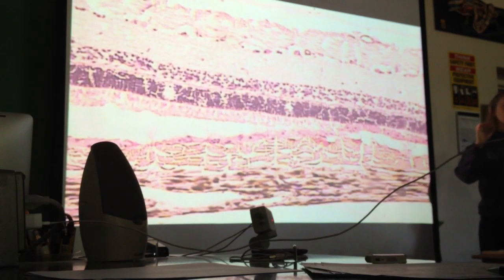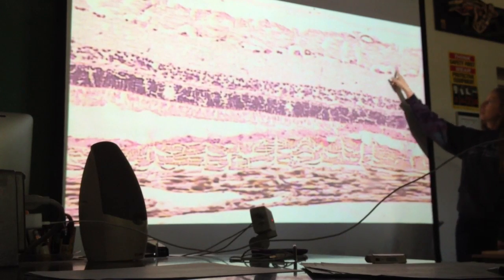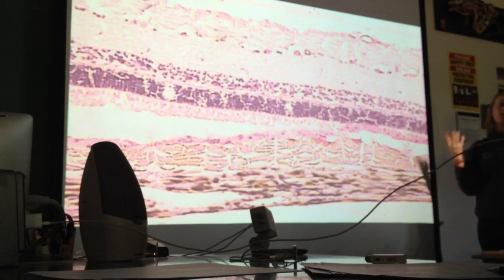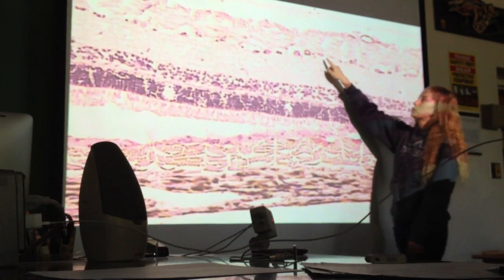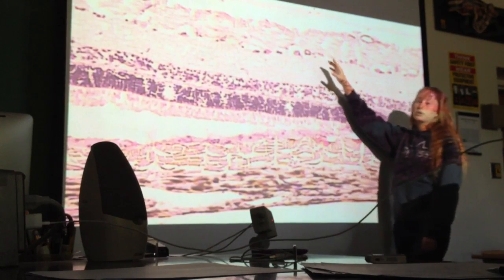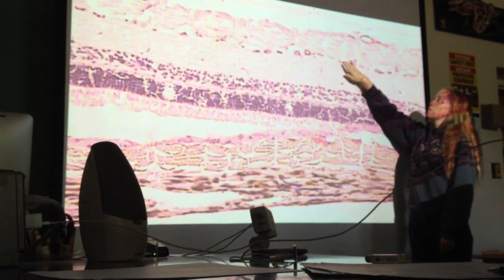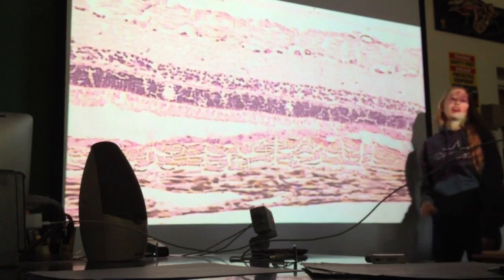You don't see them everywhere in the layer, but the Purkinje cells are dispersed throughout, and they look a lot like this. These are the ganglionic neurons, and they follow basically the same pattern. So you have a breadcrumb trail of larger purple nuclei, and then the space above them, okay? So from here to here, that layer will be the ganglionic neurons.